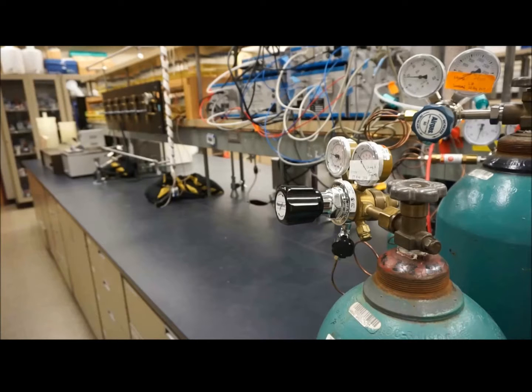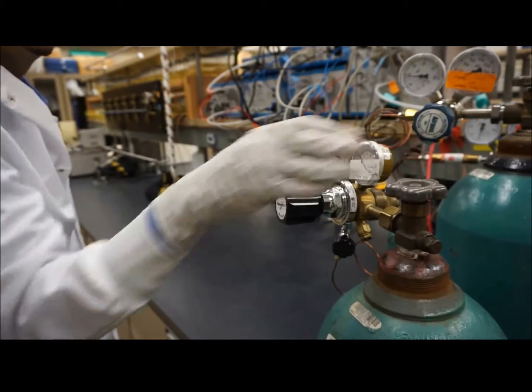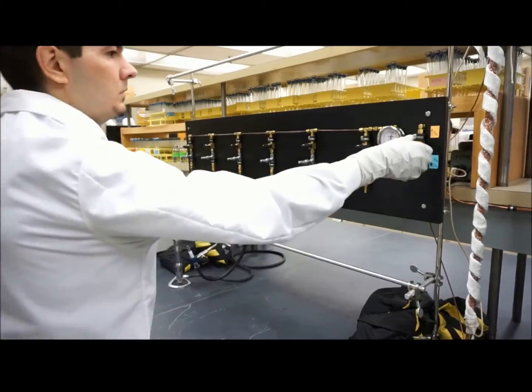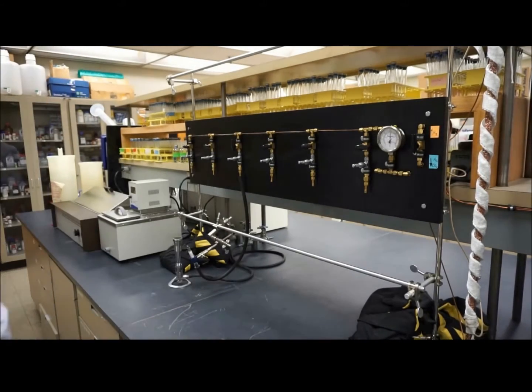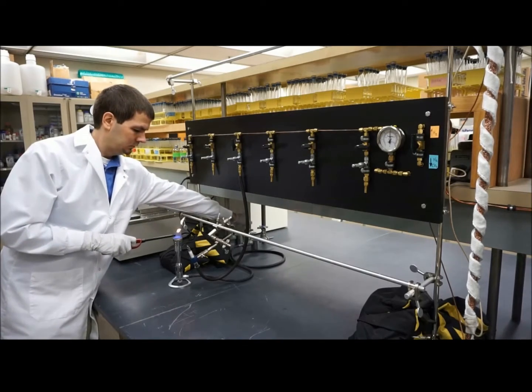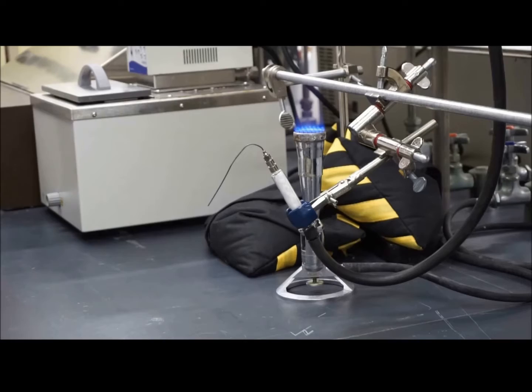To transfer an anaerobic culture, we first turn on the CO2 tank. Next, we turn on valves on the gassing station to start the flow of CO2. After that, we turn on the Bunsen burner, just as we do in aerobic microbiology.